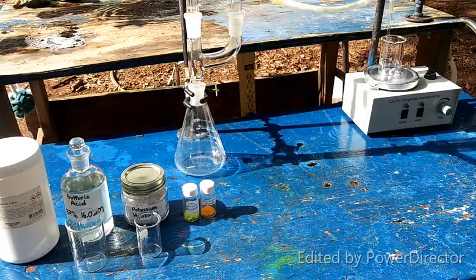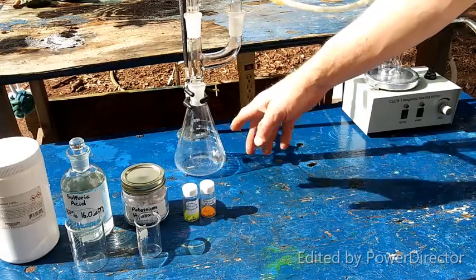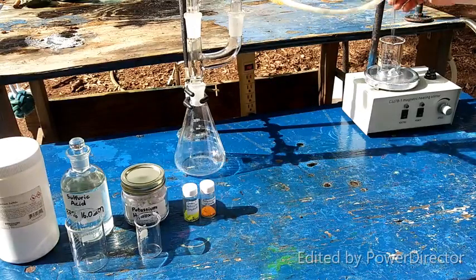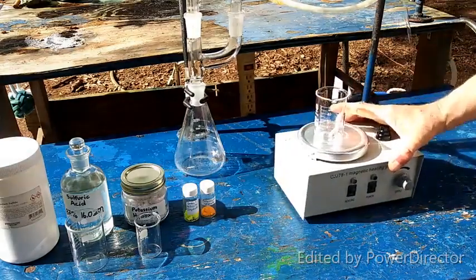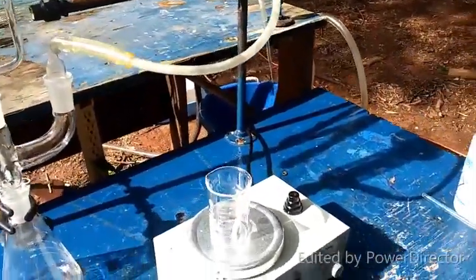Alright everyone, this is everything that we're going to need to do the experiment. What we've got here is our gas generator, where we're going to create the hydrogen sulfide that will then come up over here and bubble into our solution. But the first thing we need to do is to create our solution. So let me move you over here where I'm sure you guys can see everything.